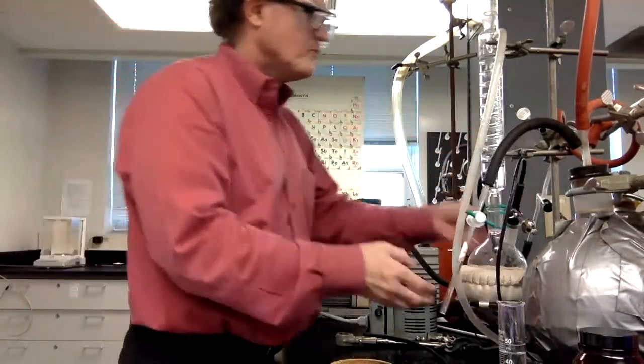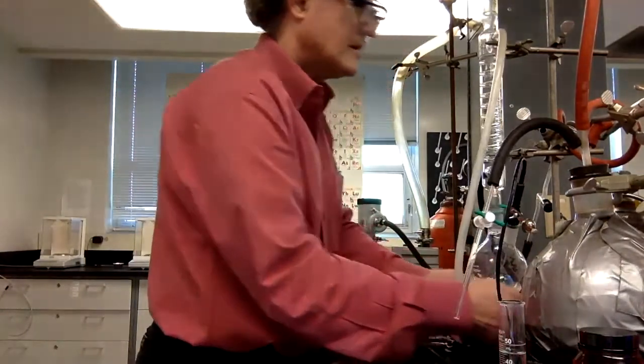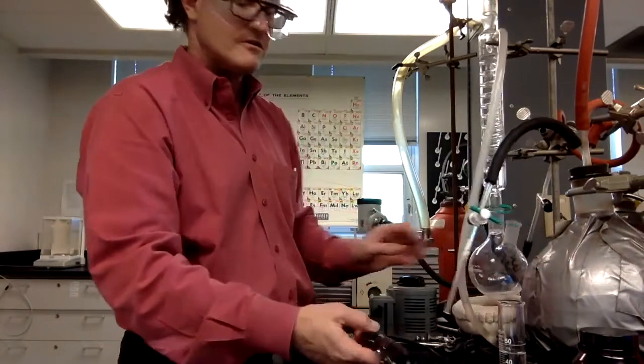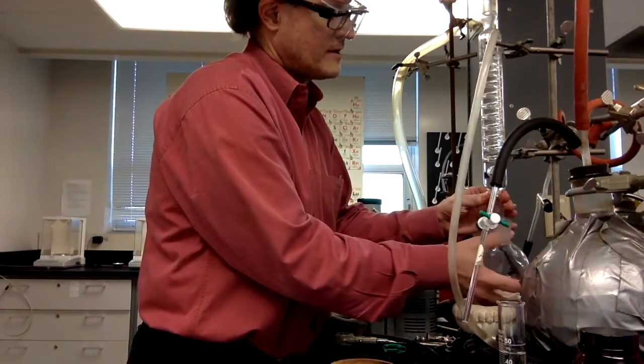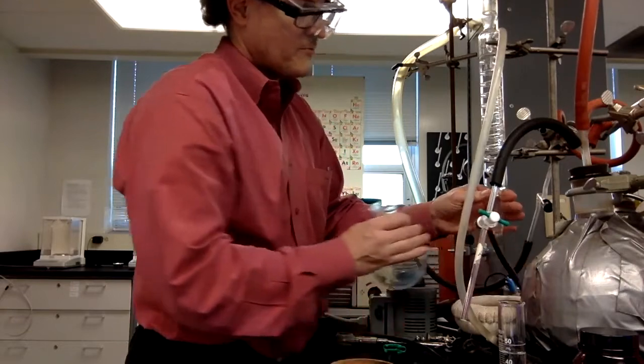Then we can remove this. We have to loosen back here, right? We can now take the thermistor off of there, snap that off, and we can remove the round bottom flask.